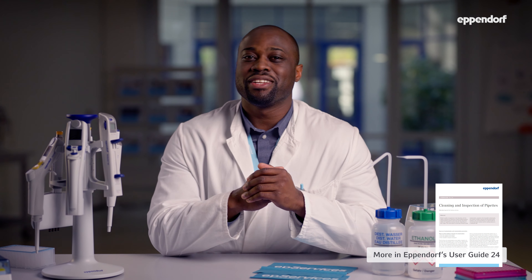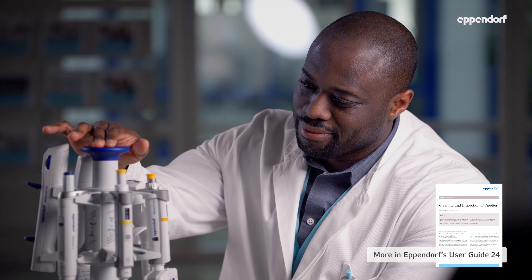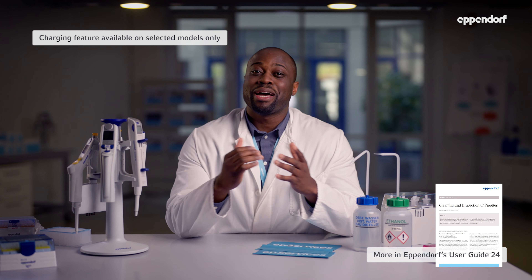Most positive displacement tools cannot be autoclaved. The samples are already protected by a piston inside the tip that creates a hermetic seal between the sample and the instrument. To prevent your pipet cones from being contaminated with aerosols, we recommend storing your pipets on a standing pipet holder, like this pipet carousel. Using a pipet carousel also makes it easy for you to keep a clean and well-organized workspace, and it keeps your electronic pipets charged.